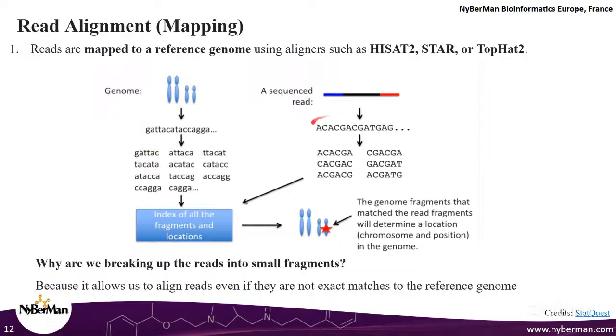Now, when you have a new read, it is not necessary for you to look through the entire genome, right? If you have a read of 100 base pairs, I mean, if you want to use brute force, you can start from base pair number 1 and look through till base pair number 3 billion and find out where exactly you have the match. That is plausible, yes, but that is extremely computationally intensive and time taking.